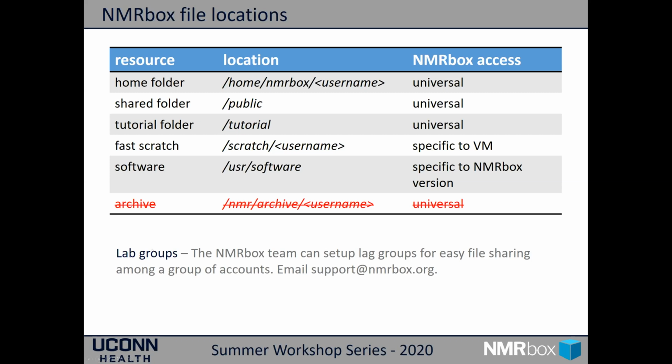However, if a group of users contacts us through an email at support@nmrbox.org, we can take a group of users and group them together into a lab group and change the primary group for all those users. Then they can open up group permissions on their files to allow the group to have read access to their files for sharing.